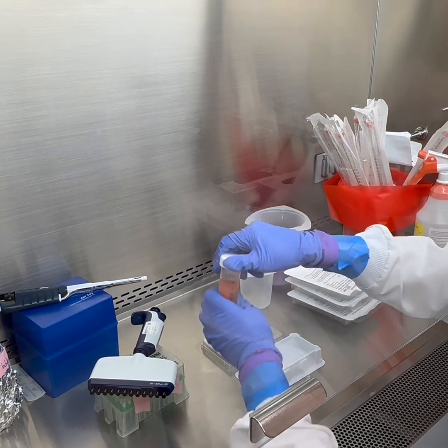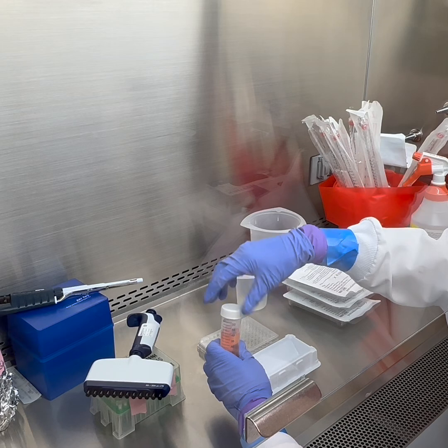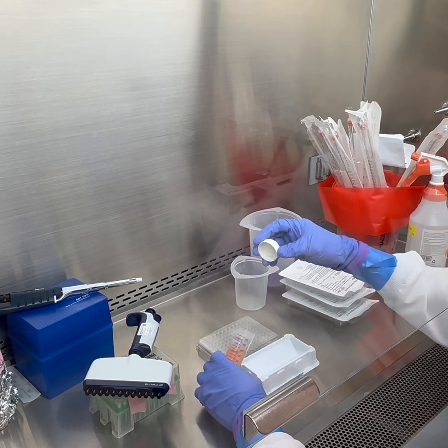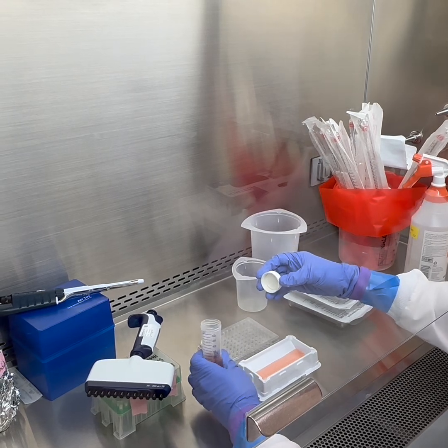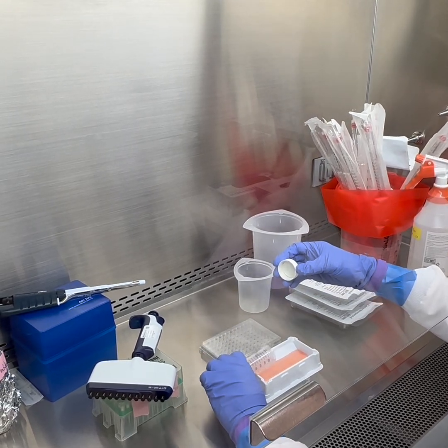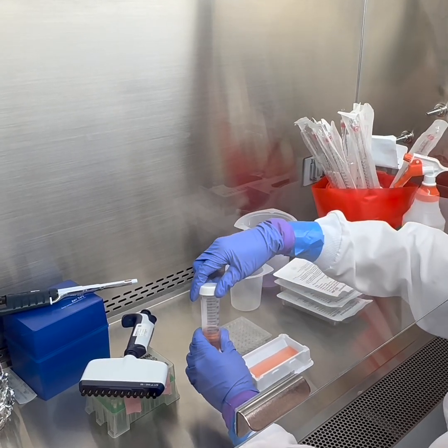Okay, should be good. I'm just going to pour out about 20 milliliters because I'm just doing 2 plates. The other plates are Hannah's. You can choose to pipette this if you're working with auris.